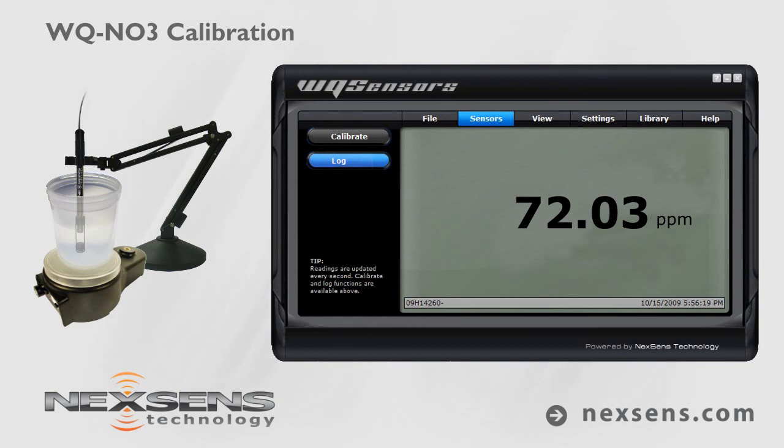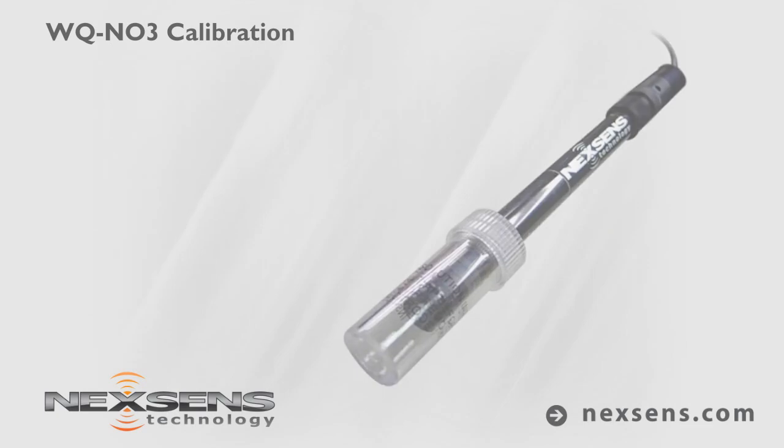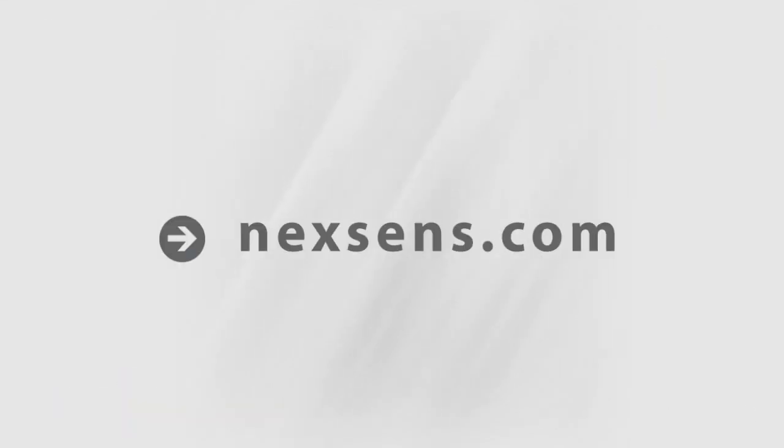Quality data collection requires frequent calibration. For best results, calibrate before each use. When not in use, the WQ Nitrate sensor should be stored in the bottle in which it was shipped. NexSense WQ sensors — the latest in smart sensor technology.